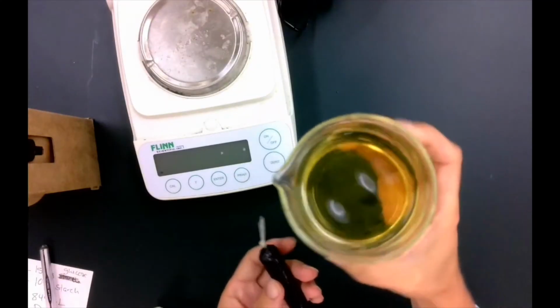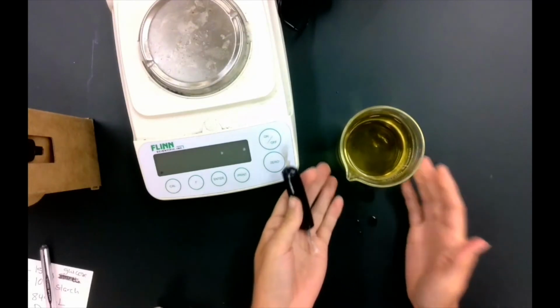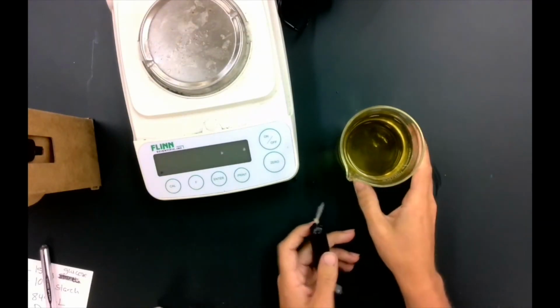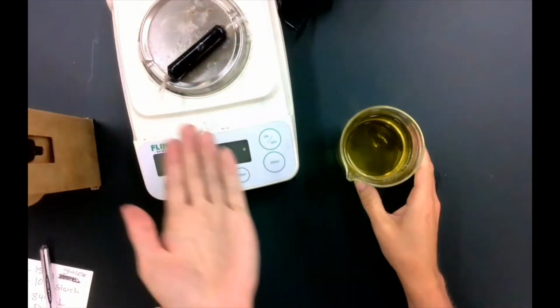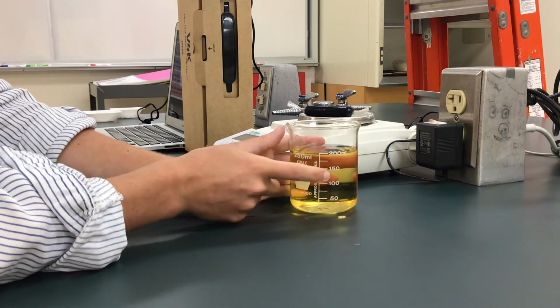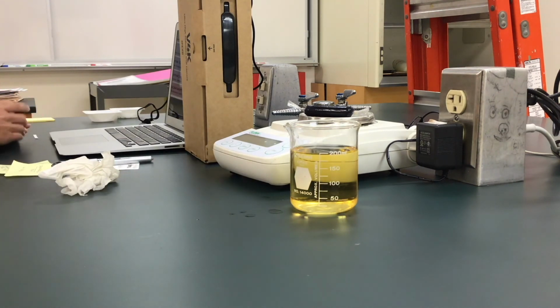Now, do we see any blue color in our distilled water Lugol solution? No, we don't see any blue color here. So it's indicating that none of the starch has left the bag and the starch remains in the dialysis tubing, which makes sense to us. And we also want to see if there's any glucose in the distilled water.